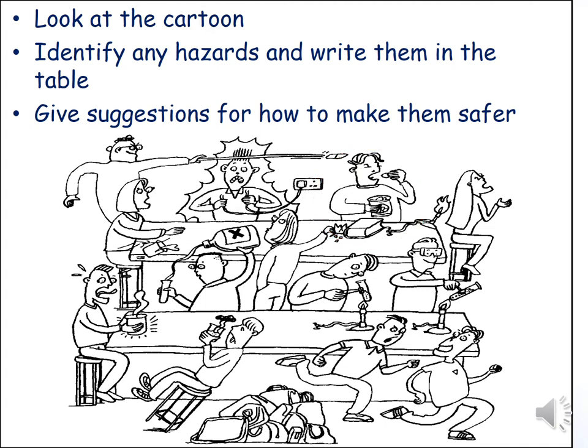Let's have a look and see all the different types of hazards that you might have noticed. So I'm going to circle some of the ones that I can see very clearly, and you can check to see if they're ones that you have also noticed. So we have our first one that we have as an example of someone eating within a lab.